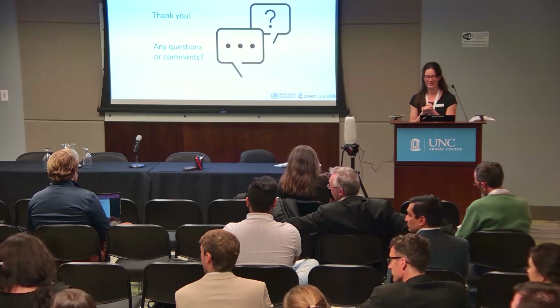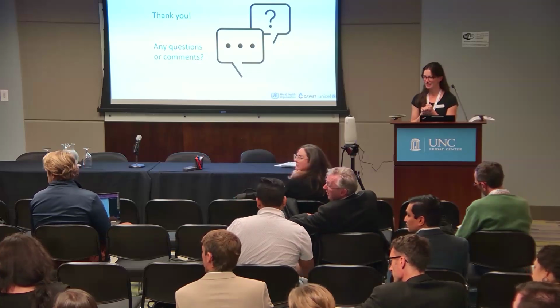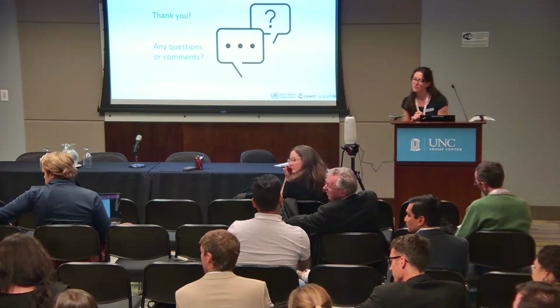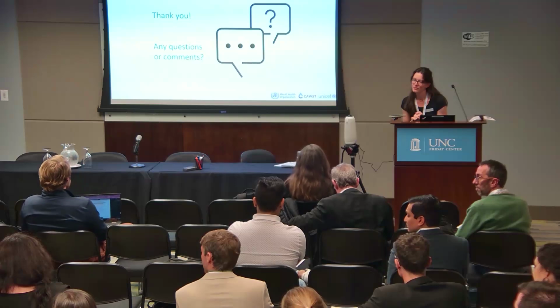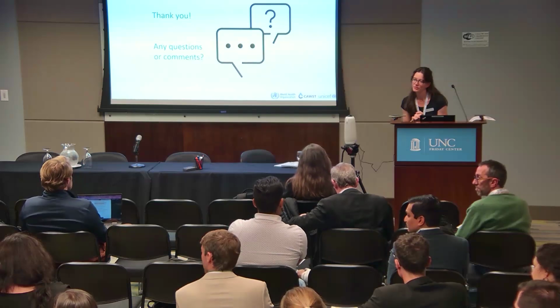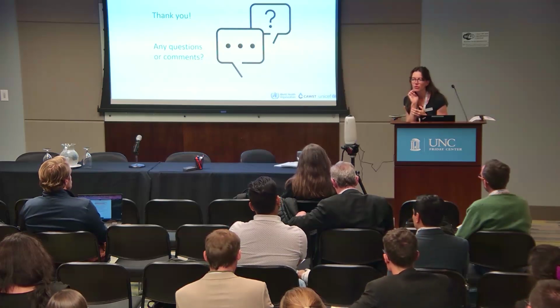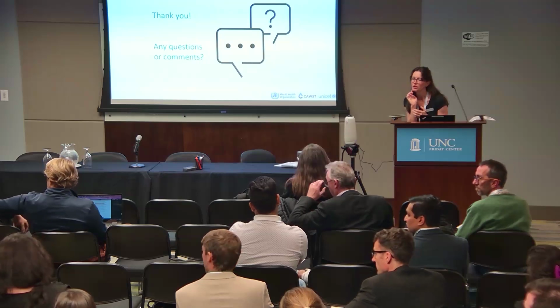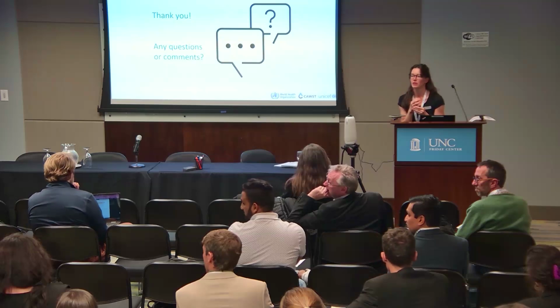My work is with community samplers and citizen scientists. I just wondered if your document was able to highlight whether any of the field tests would be appropriate for such uses, or if it's best to look through based on cost and usability, or if you were able to specify any that could be for public use. I'm at the University of Leeds, and my work focuses on citizen science.